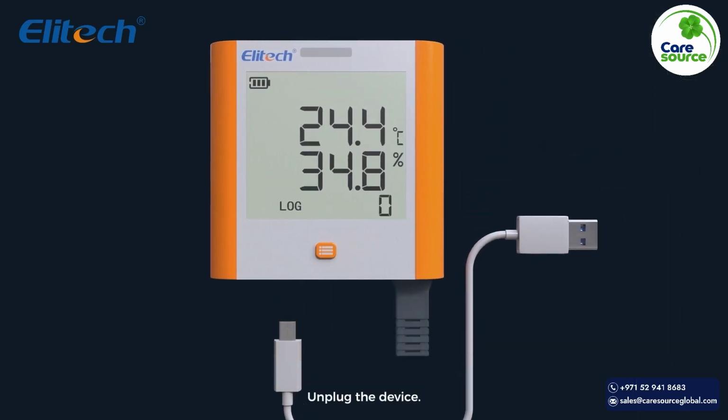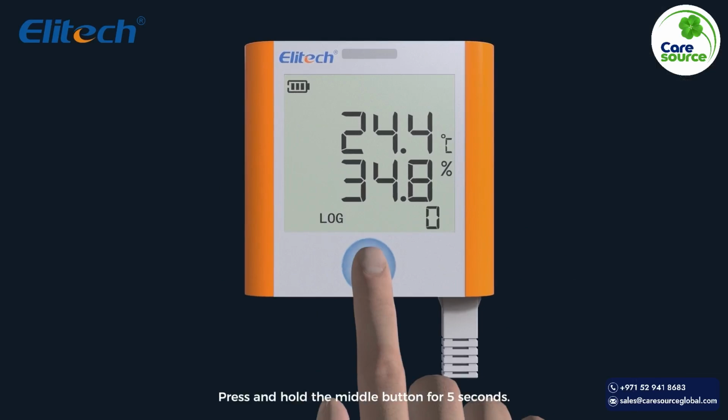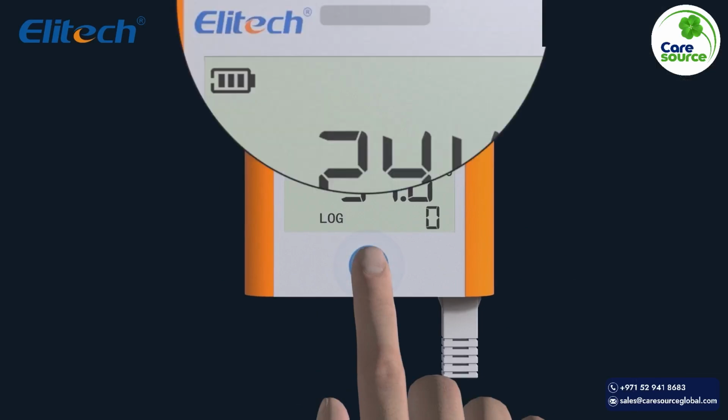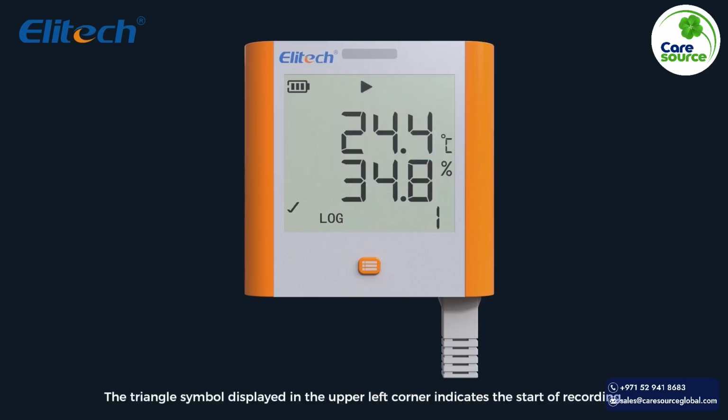Unplug the device. Press and hold the middle button for 5 seconds. The triangle symbol displayed in the upper left corner indicates the start of recording.